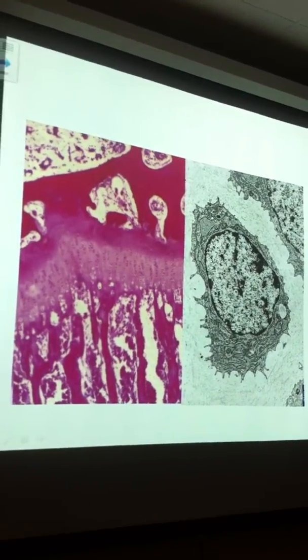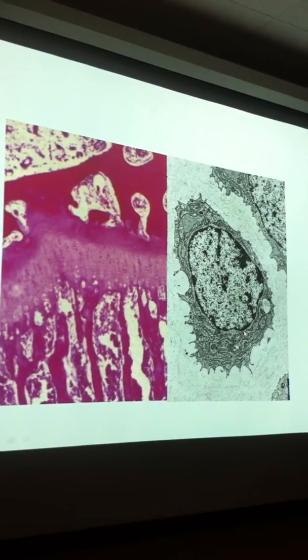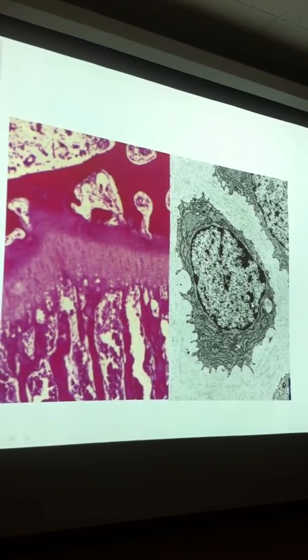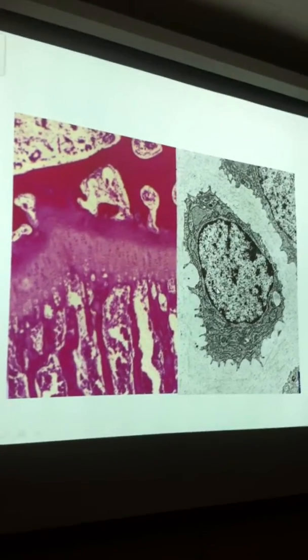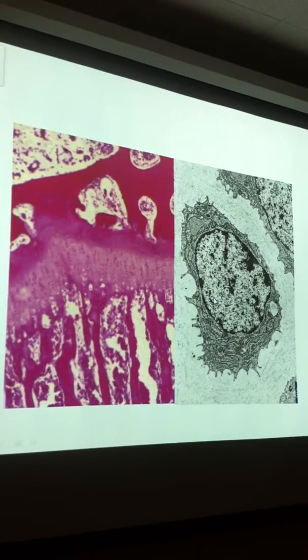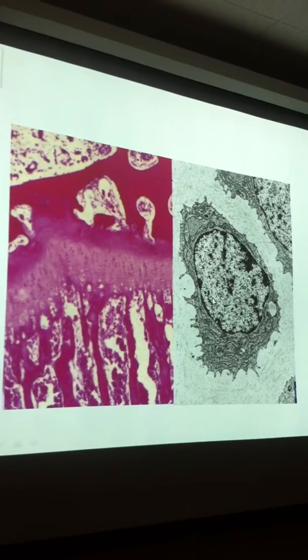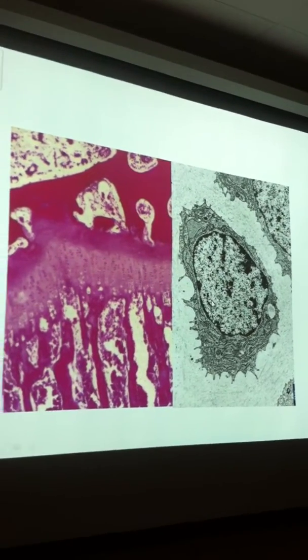Or chondroblast. Actually, it is a chondroblast. It is a blast. I don't know how they say it over there, but the truth of the matter is that it's inside a lacuna and it divides. They say chondrocytes, but they are technically chondroblasts. Look at the euchromatin versus heterochromatin, and the extensive amount of rough ER.